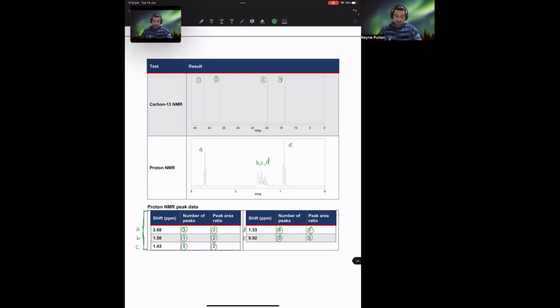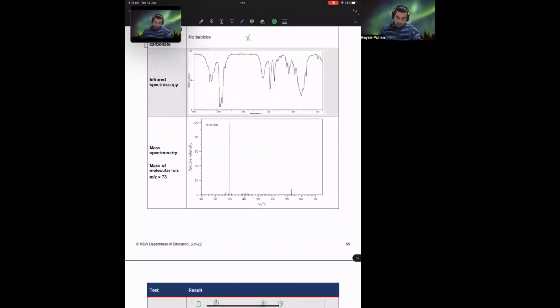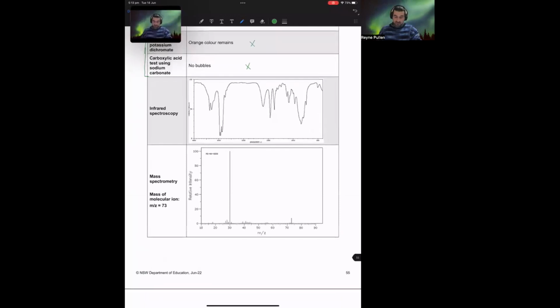And also, we've already talked about how in the carbon NMR, there's something more electronegative than carbon that's de-shielding the carbon next to it. And we know that nitrogen is not as electronegative as oxygen. So these things are coming together, but we need to confirm this. So let's move back up here to our mass spec and our IR. And I think in a rare change of circumstance, I might look at the IR first. Normally I go to the mass spec, but I'm not sure of what functional groups are present. So I think I need to look at the IR to try and narrow that down.